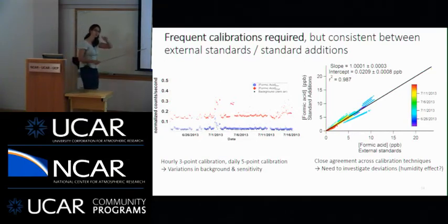And the mass spectrum of it changes a little bit too. So this is our background. It changed. And then we had this low amount of formic acid and a high amount of formic acid, and those changed as well. So what this really means is that the sensitivity of the instrument was changing on the time scale of hours, and the background of the instrument was changing on the time scale of hours. So it was very important for us with our instrument to at least do those frequent calibrations. I think some instruments seem to be more susceptible to these variations than others, so it's very instrument specific. But for our system, at least, we needed to do these very frequent calibrations.